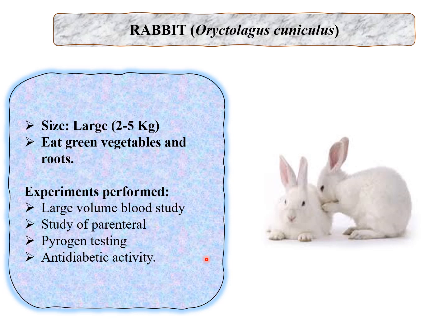So we have seen the rabbit. Likewise, we can use the dogs, monkeys, and cats for the same activity at larger scales. The dogs, cats, and monkeys are not used at institute level or college level. The studies on them are mostly done on a larger scale.